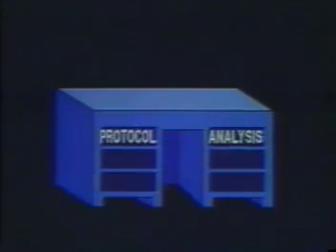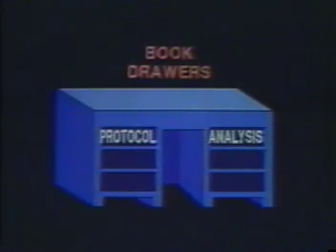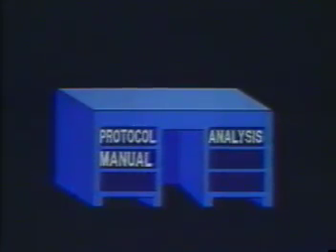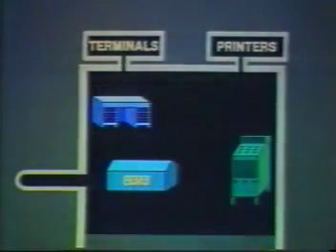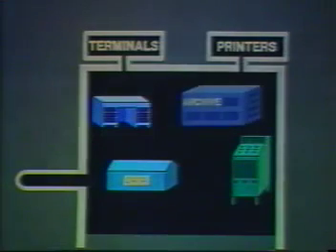The third kind of FACS Desk drawer is called a book drawer. Book drawers are not used for running experiments. They simply store text information. Every desk comes equipped with a book drawer that stores an online owner's manual. There is one special drawer that can be found on every user's desk. It provides chronological, author, and title indices to experiments stored in a fourth element of the microworld, the Analysis Drawer Archive.